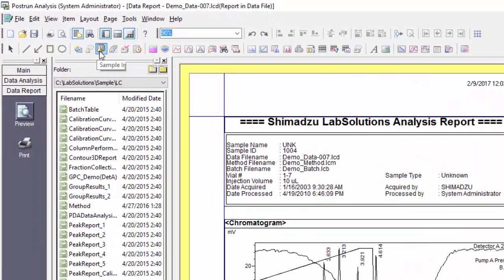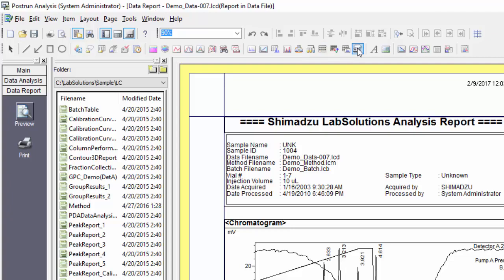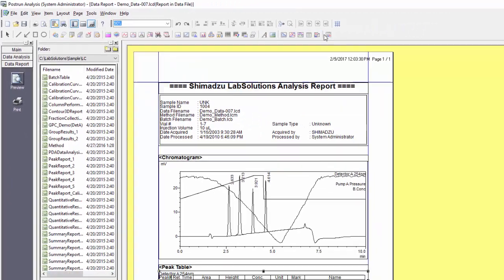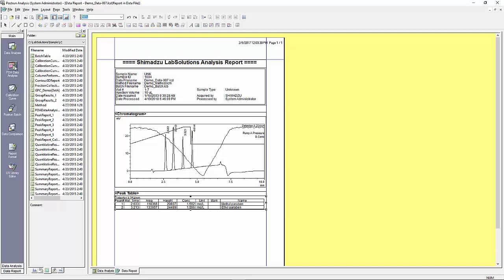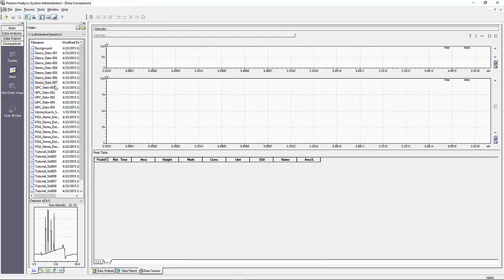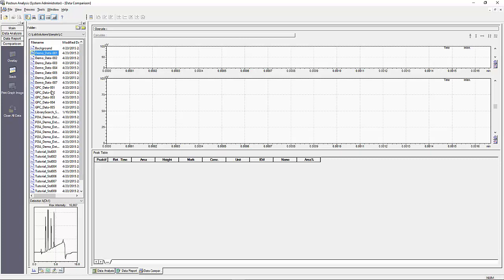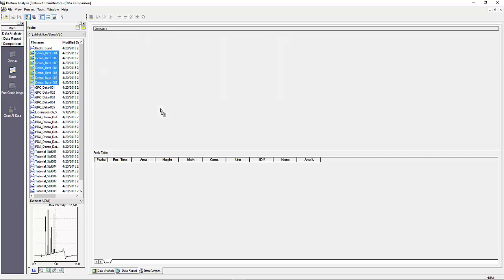In addition to having those options available from the drop-down menu, they also are available as icons in the action toolbar. Once you have selected the item either through the drop-down menu or the action toolbar icon, all you need to do is then drag a field in the editor page below to create that item on the page.